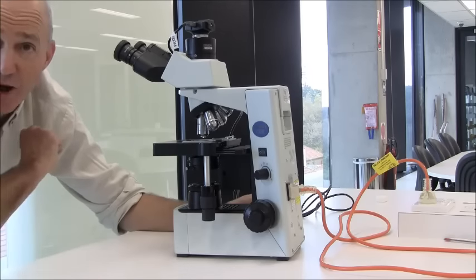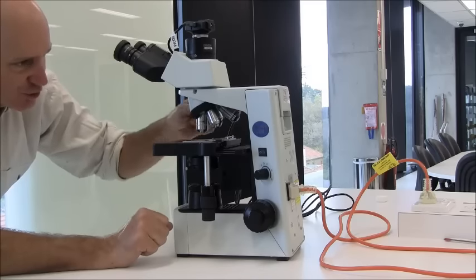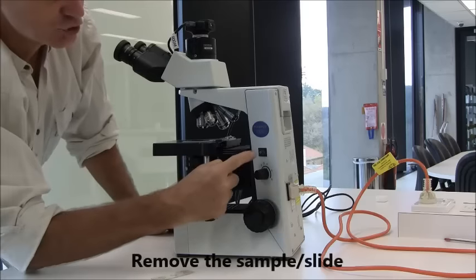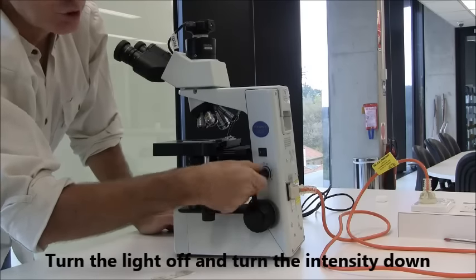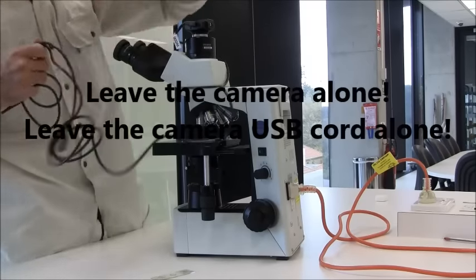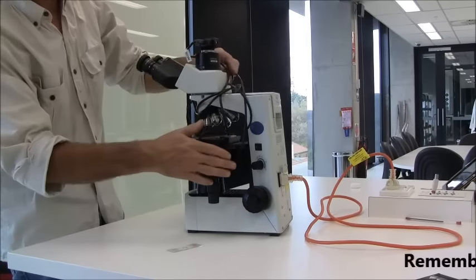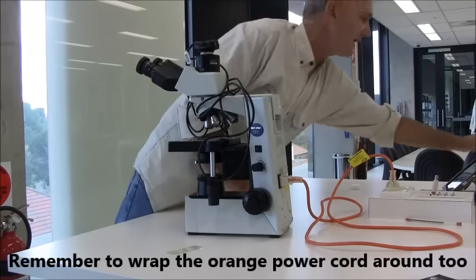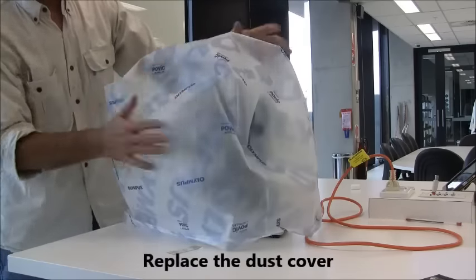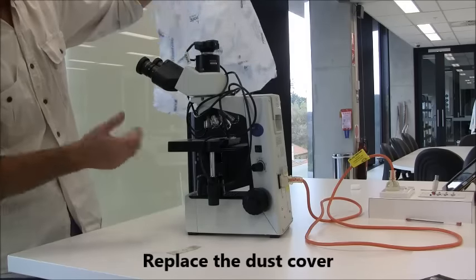Now, putting this away, just very briefly, the pack-up procedure is to return it to its lowest magnification, always remove the slide, turn off the light source, put it onto its lowest light intensity, just loosely wrap the cords around. They don't have to be tight or even very neat, just loosely wrapped around, and of course, pop back on a dust cover. And most students would appreciate when they get a microscope out finding it in that condition.